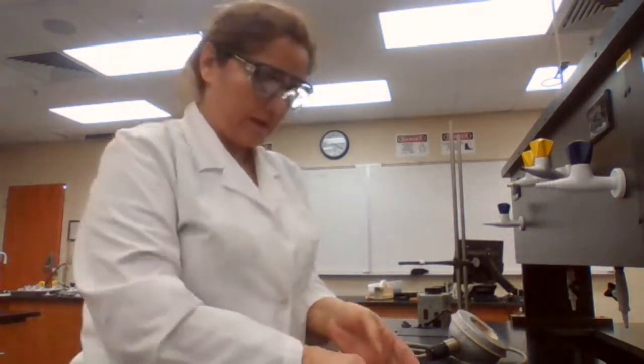Good morning. We are going to learn our first technique for separation of organic compounds. If the organic compound that we are trying to separate is liquid from its impurities, we can use distillation.